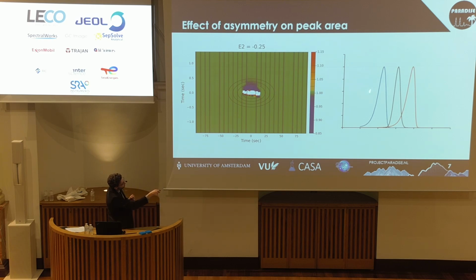However, if you approach a peak away from the tailing end, or you approach a peak at the fronting end, you can see that because we record the recovery of the moving peak, we end up incorporating part of this tail into the stationary peak rather than the moving peak. Because we simulate both peaks and we know the exact areas, we can see where this area ends up.